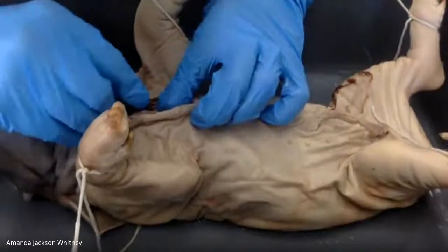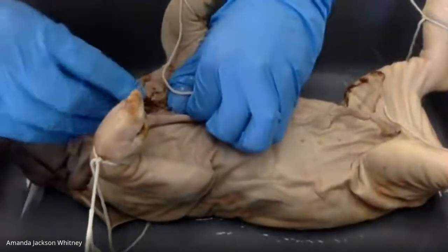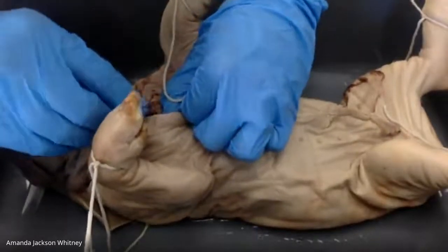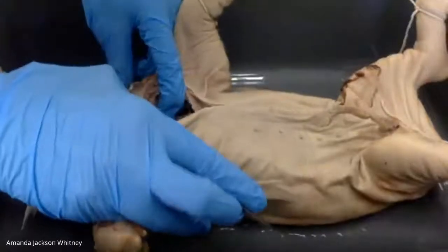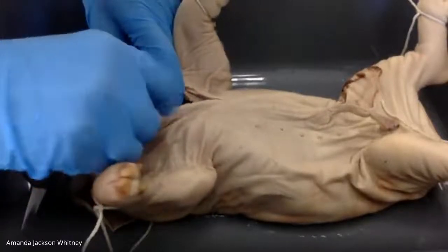There's 2 main sets. One is external and one is internal. Anyone? Is it our intercostals? Good, yes, our intercostals. So we've got the external intercostals and then the internal intercostals.